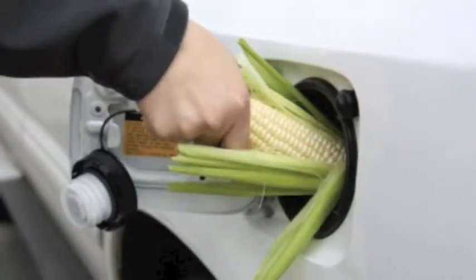Biofuel is a liquid fuel derived from plant materials. The following experiment allows you to make this technologically advanced fuel.